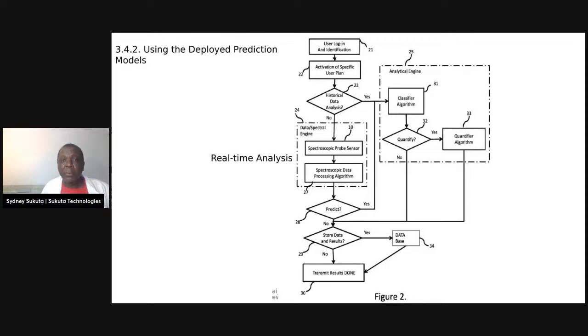And it is processed, and you predict. You declare that you want to predict, and then it goes back here. It will classify the sample first, and I'll show you. It's going to classify the sample. If that's all you want, you're done. Next, you have the option to quantify, like if you want numbers, like pH 7, ABV, let's say whatever, a percentage.